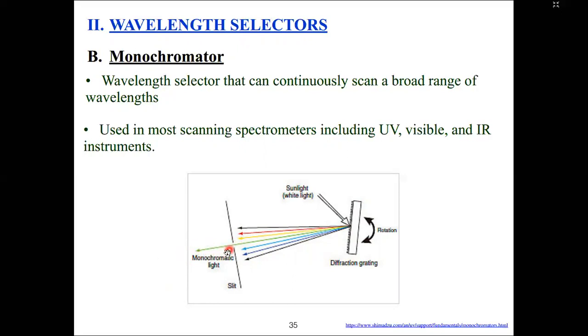So now the green is passing, so the interaction between the sample and the green color occurs. Then after that, the next green will transfer, then comes the time of yellow. There are different yellow colors, then red, different colors, right? That's how it will help you to transmit only one color. All others are blocked. As you can see, there is a small hole through which a narrow wavelength of light can be passed. This is the monochromator.